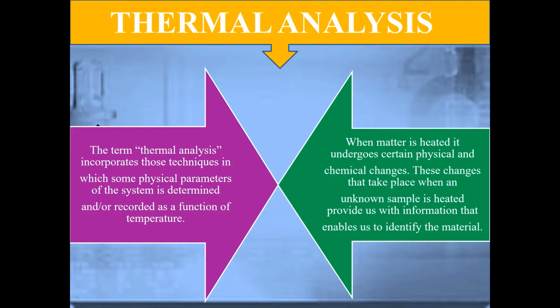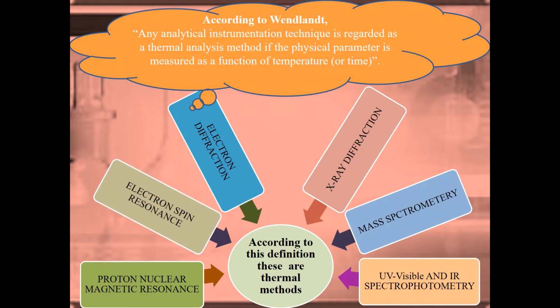According to Wendlandt, any analytical instrumental technique is regarded as a thermal analysis method if the physical parameter is measured as a function of temperature or time. According to this definition, these are the thermal methods, that is electron diffraction, X-ray diffraction, mass spectrometry, UV visible and IR spectrophotometry, electron spin resonance, proton nuclear magnetic resonance.